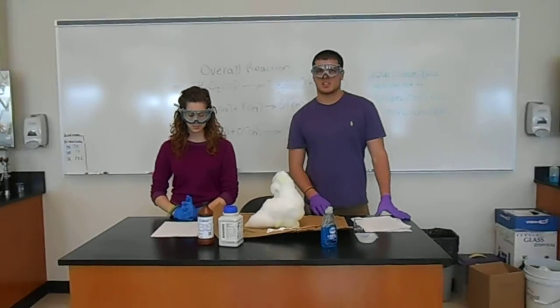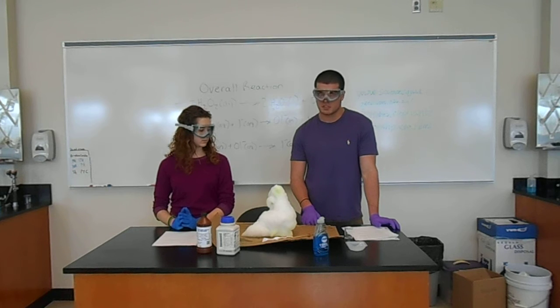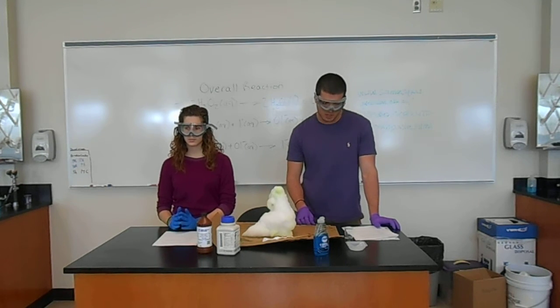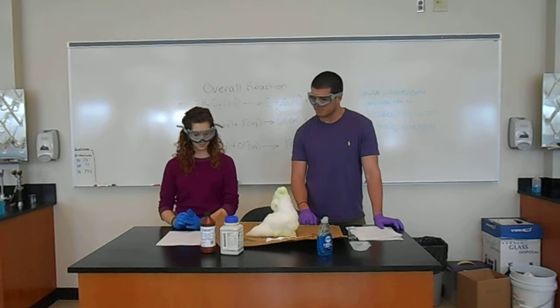Okay, so this reaction caused foam to come out of the graduated cylinder. It was a yellowish tint, and the foam is created when the three solutions are combined. The reaction also gave off steam.